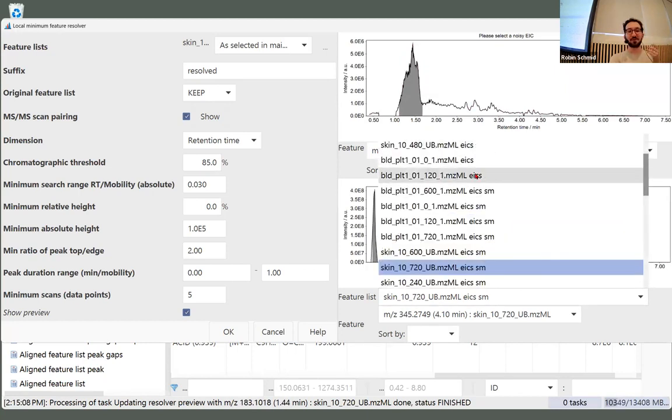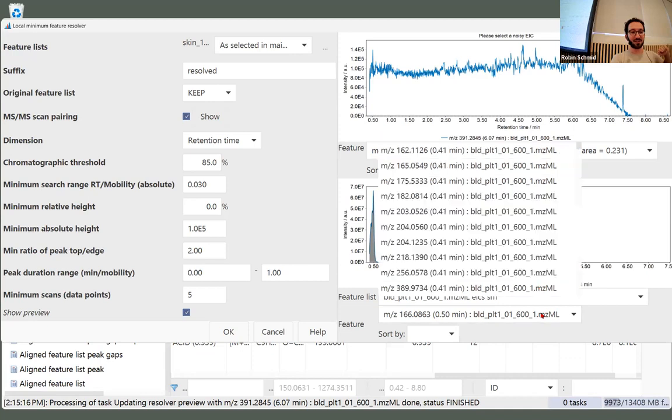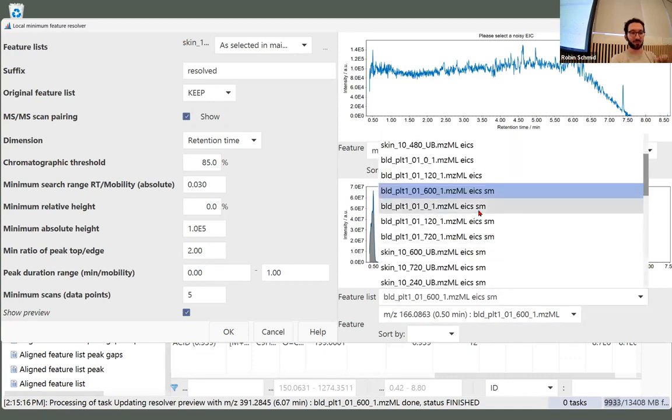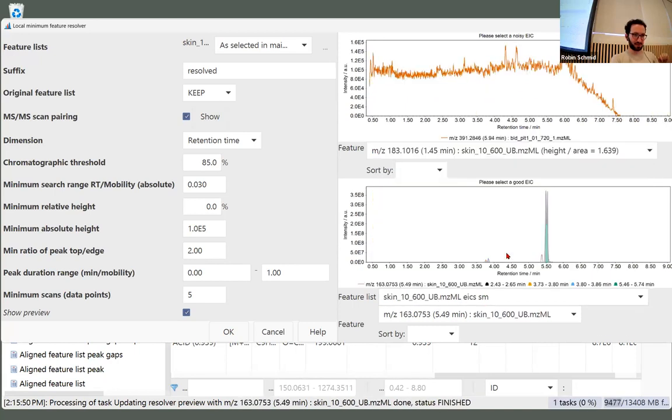And it's very much just to give you some idea of the worst case, which is up here, which is just something that might be in the water, and then we ramp up ACN, it goes away, or it might be something in the ACN, might be in the air, right? So there are just some contaminants that are always there. And now on the bottom, it tries to find some features that we actually want to separate and still retain. So it tries to give you some good-looking features.